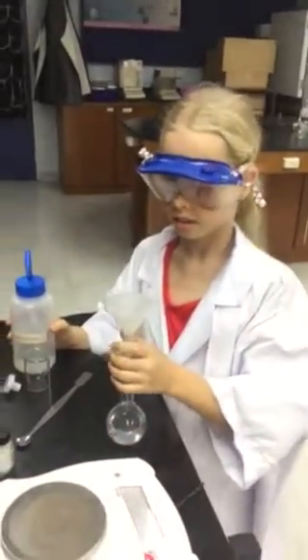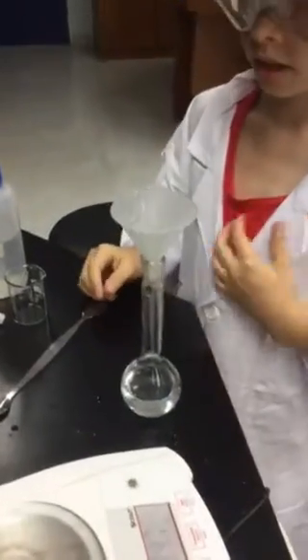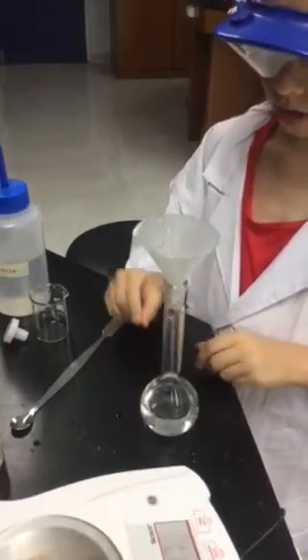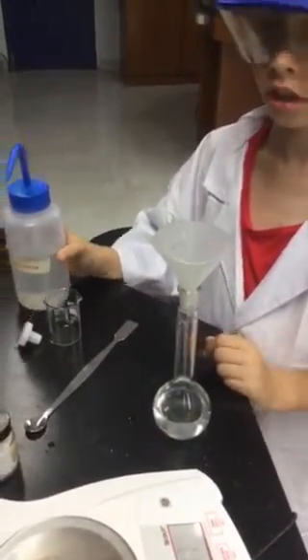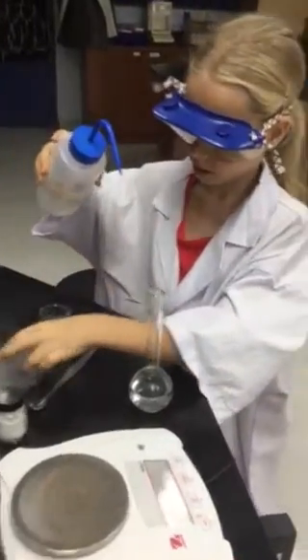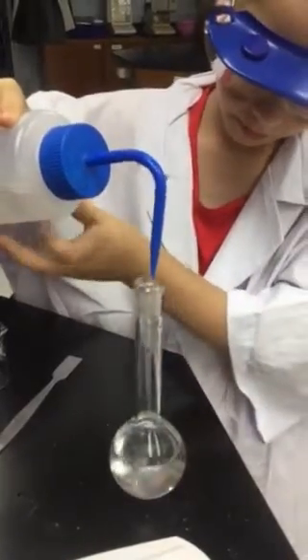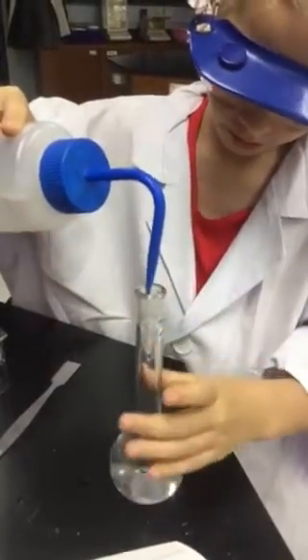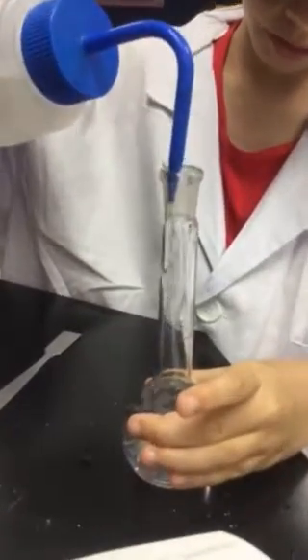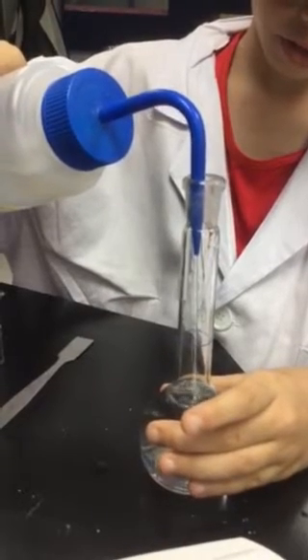Great. Okay. Now we need to make up our solution in the volumetric flask to the 100cc mark. We can go quickly to begin with the wash bottle. You can take the funnel out, Nina. Hold the flask at the same time, Nina, so we don't knock it over. Now, you can notice there's a blue gradation mark. We're going to stop well before we reach that.